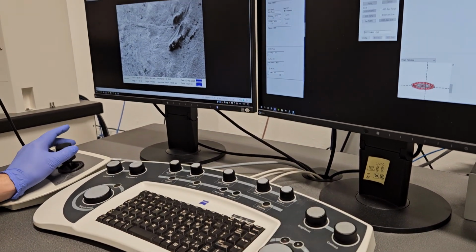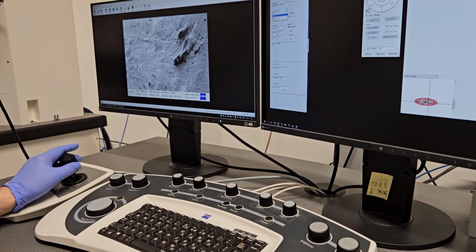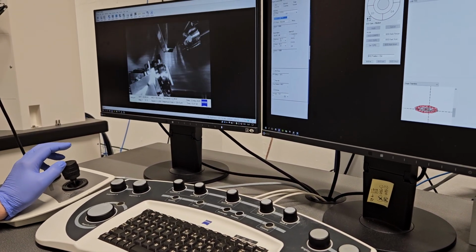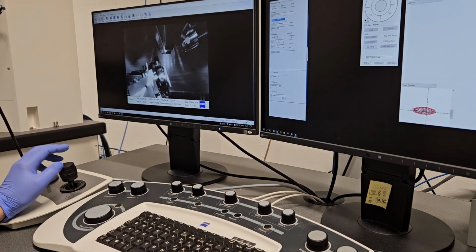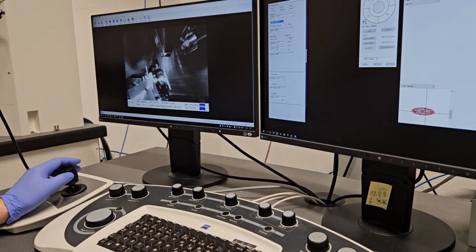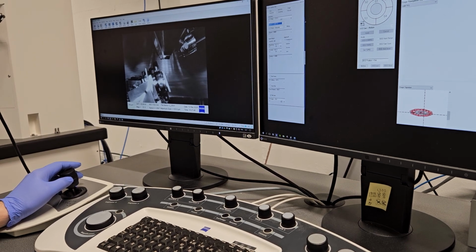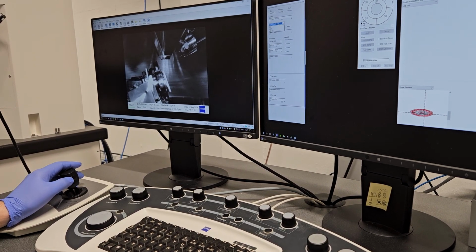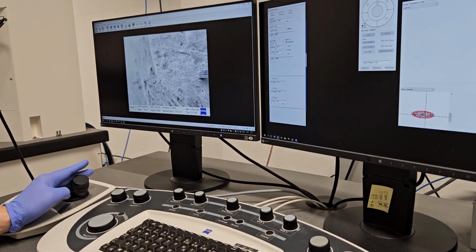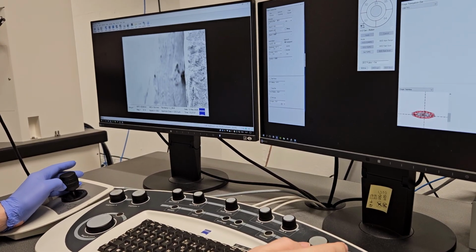Is the edge coming close to the bodies or far away? When you move along this side, this line, then it's not dangerous. It's dangerous when you move on this and also this of course. Okay, let's be systematic. Go from edge to edge. Okay, so this is the edge.